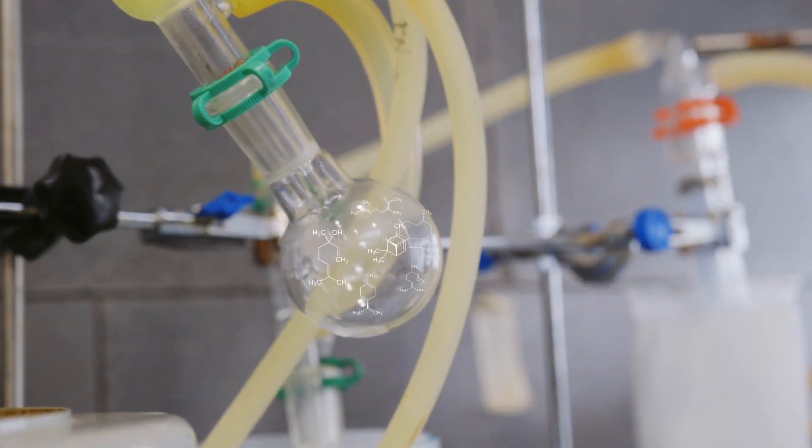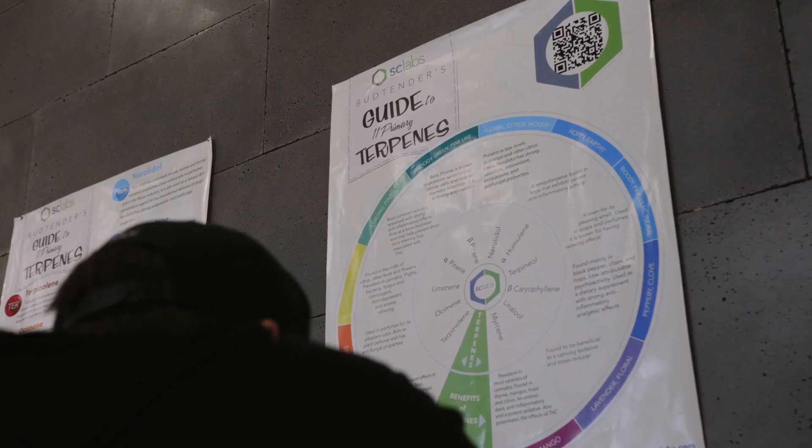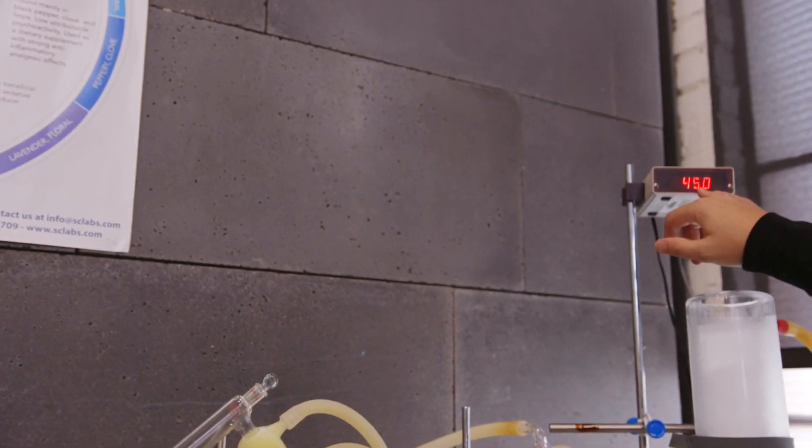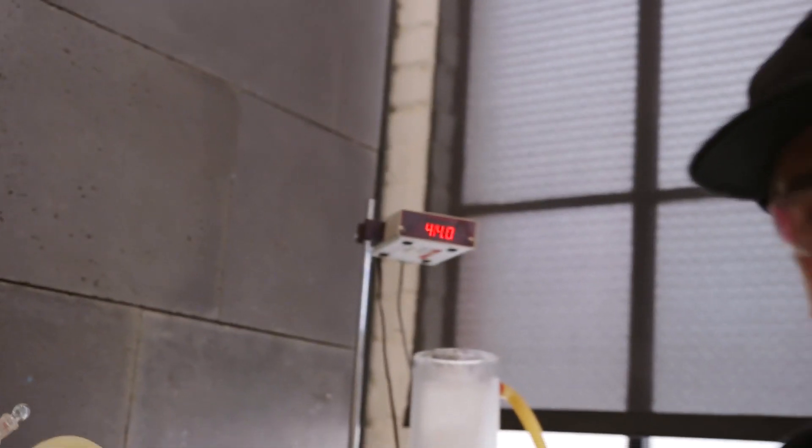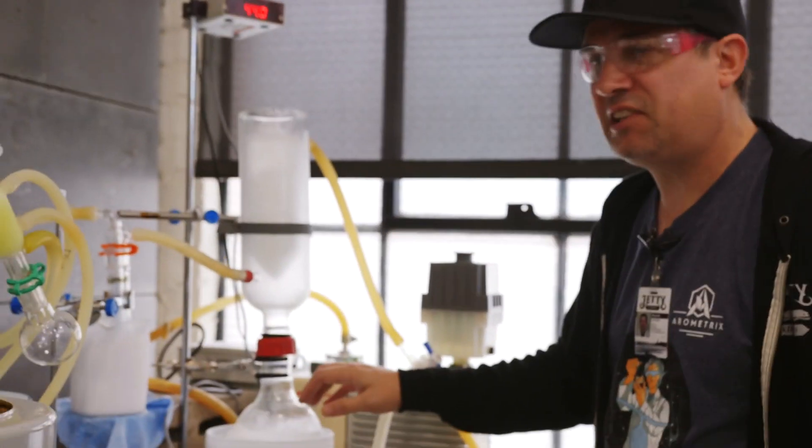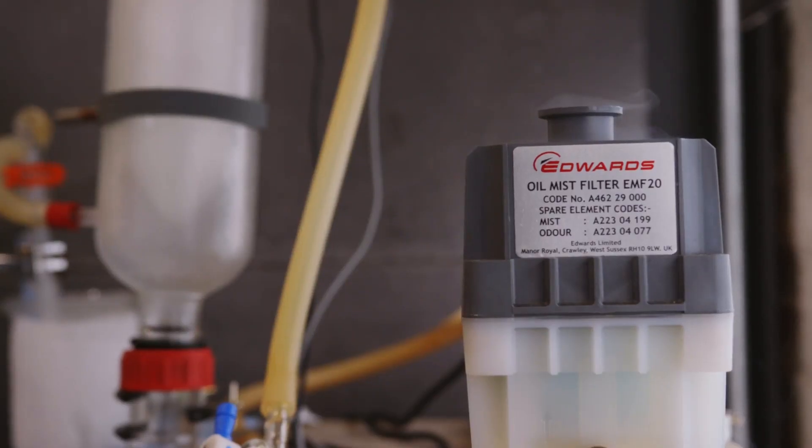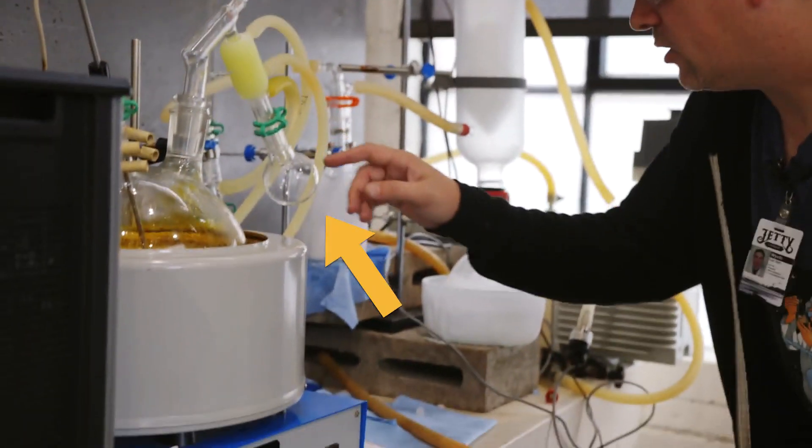I have several different traps to isolate different kinds of terpenes. Right now, we're running at 45 millimeters mercury, and that's because we're getting a lot of gases coming off. They're going to condense in here. This is kind of my waste area. The good stuff is going to be here and here.